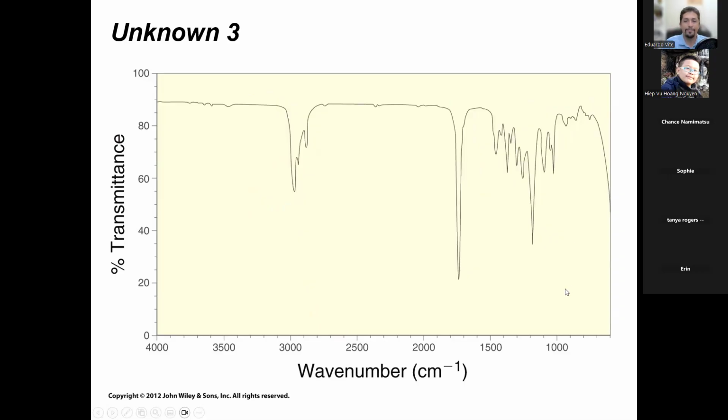What about this one here? CO. Again, you gotta be specific because is that C single bond O? Is that C double bond O? Is that C triple bond O? I mean, all of those are COs. Carbonyls. That's right. You have to call it what it is, right? A rose by any other name is still a rose, right? Yes, a carbonyl is a carbonyl.